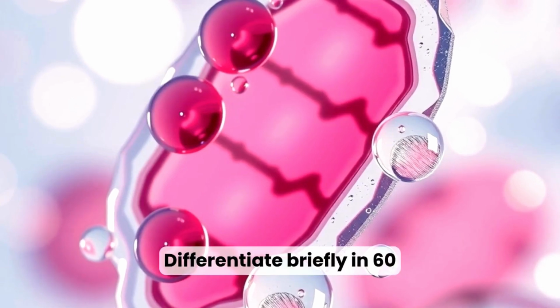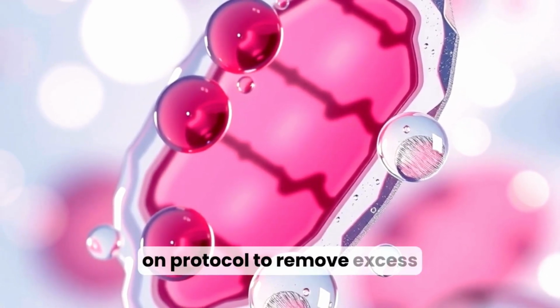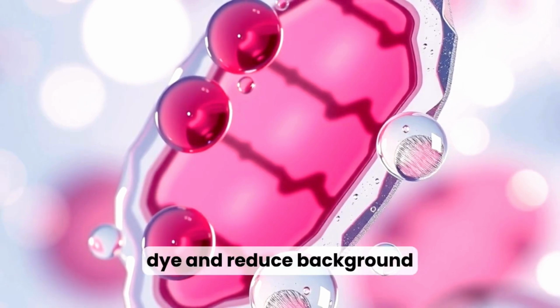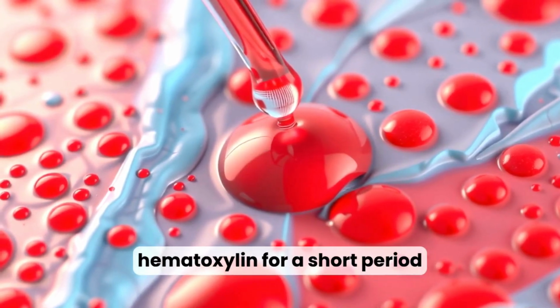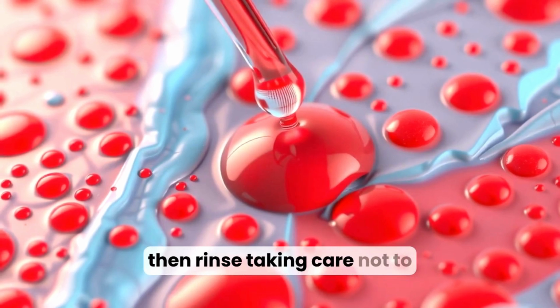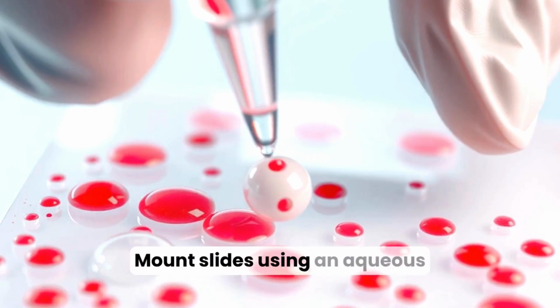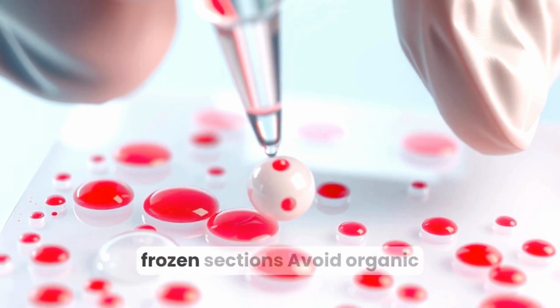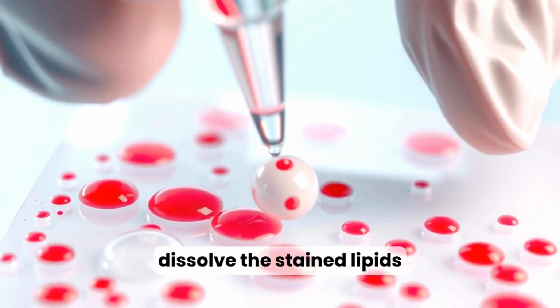Differentiate briefly in 60% isopropanol or rinse with distilled water depending on protocol to remove excess dye and reduce background. Counterstain nuclei with hematoxylin for a short period. Then rinse, taking care not to overstain which can obscure lipid signal. Mount slides using an aqueous mounting medium designed for frozen sections. Avoid organic mounting media that will dissolve the stained lipids.